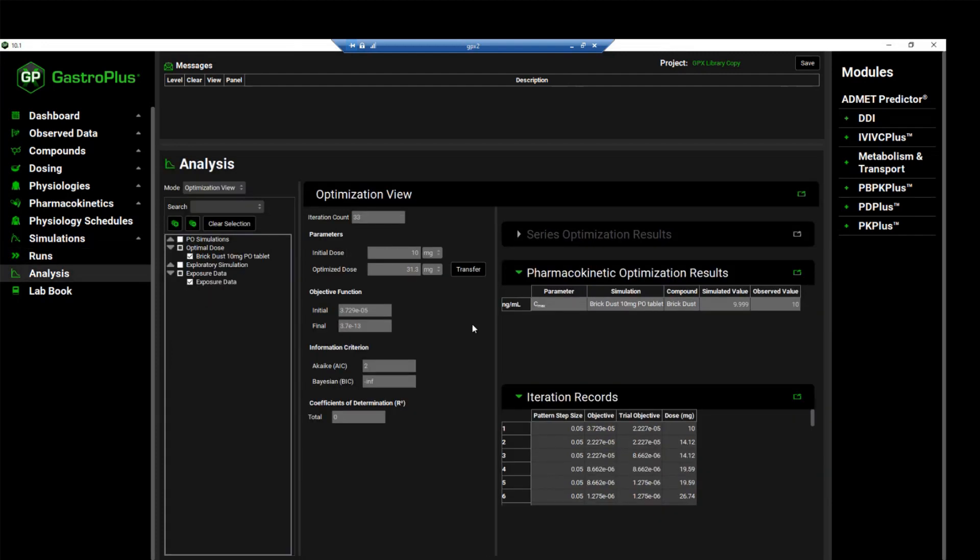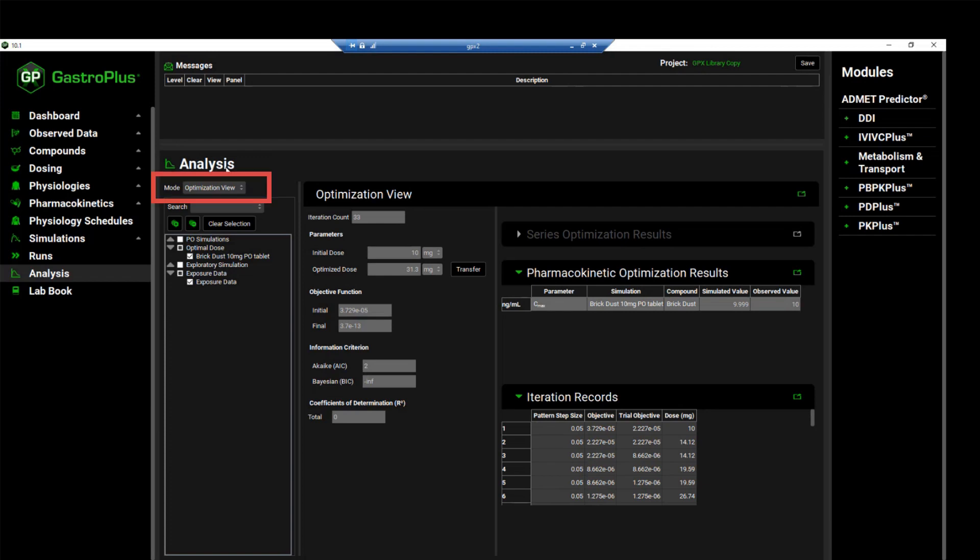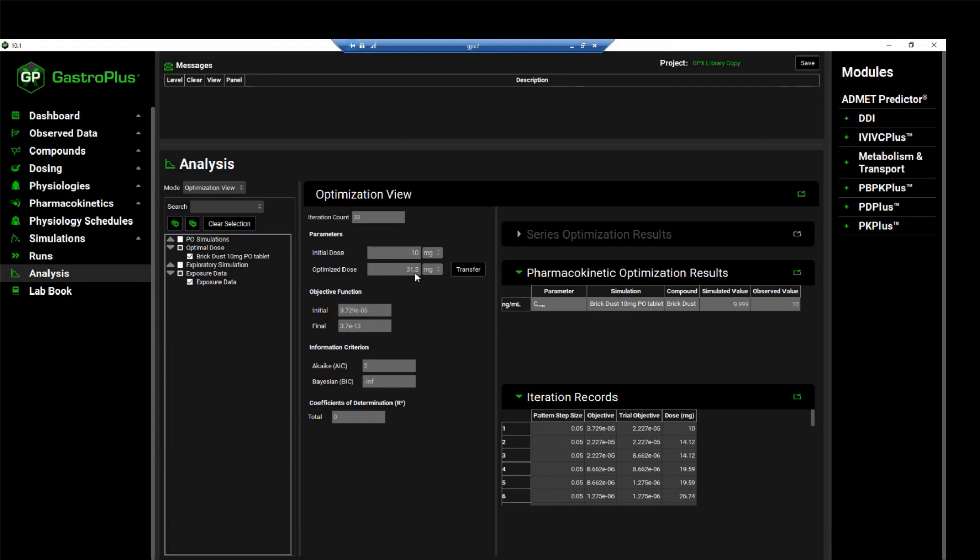When the optimization completes, the interface will automatically switch to the analysis view and using the optimization view mode. The optimization view displays the initial dose as well as the optimized dose of 31.3 mg. So the initial dose was 10 mg and the optimized dose was 31.3 mg.